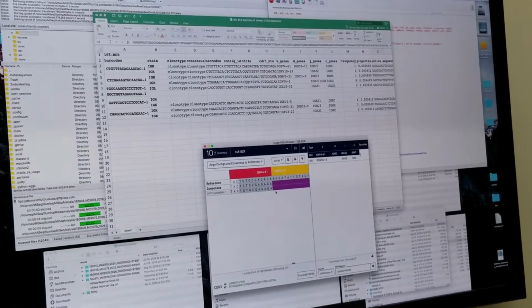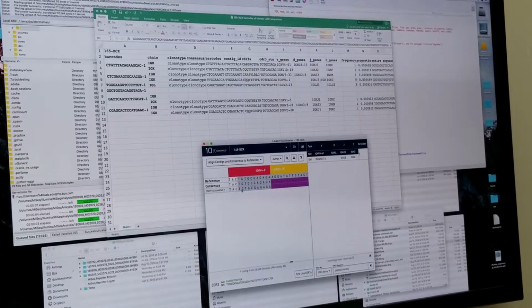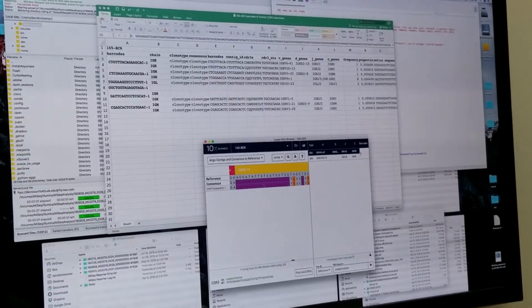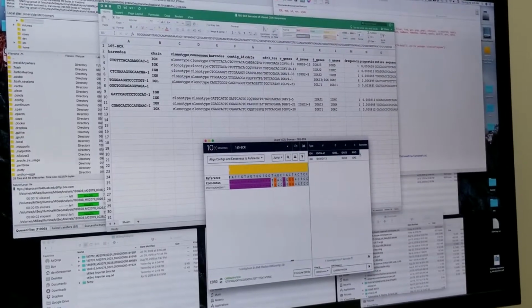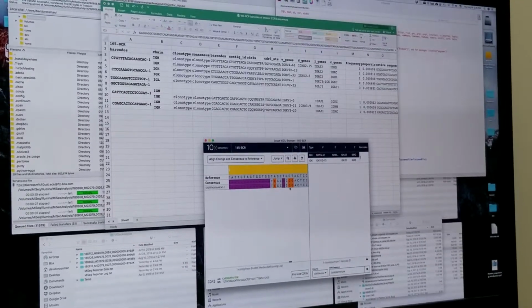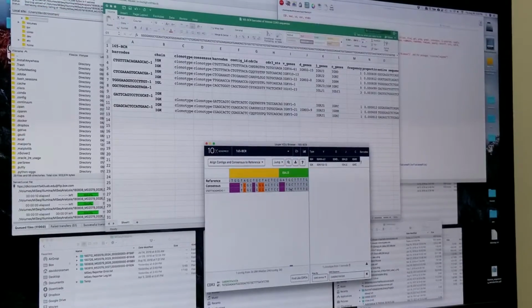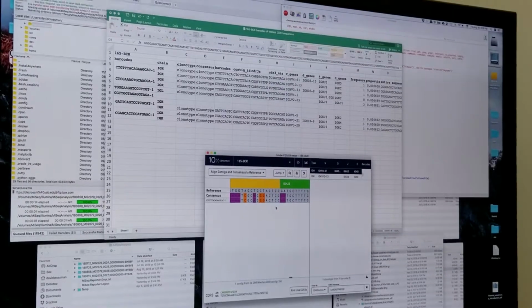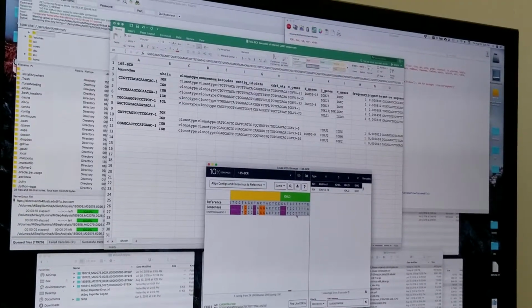I mean, this sequence down here shows this nucleotide sequence. So here's your CDR3 region. It starts with the TGT. You have this large deletion. Then you pick back up, and then you have a C that's supposed to be an A, another deletion. There's two G's here when they should be CT. So you have the sequence here all the way to the... How far does it go? I can't remember how far it goes into this region.